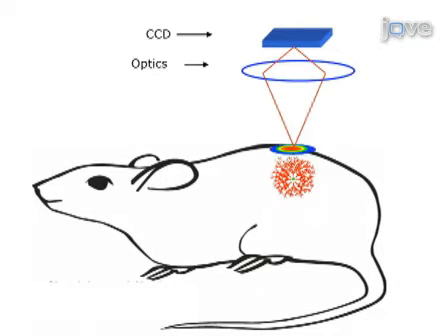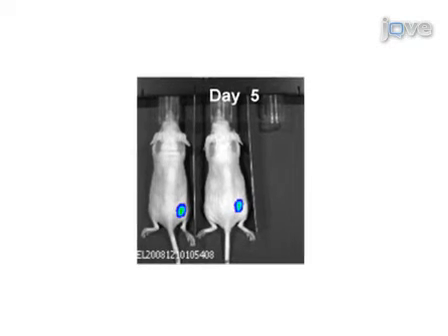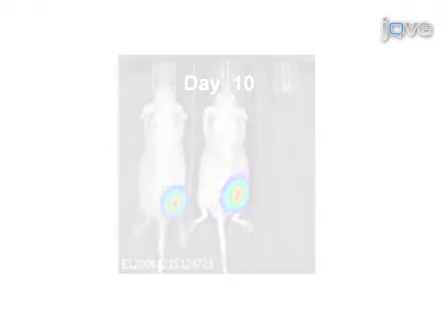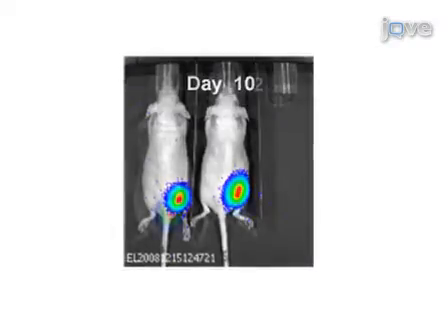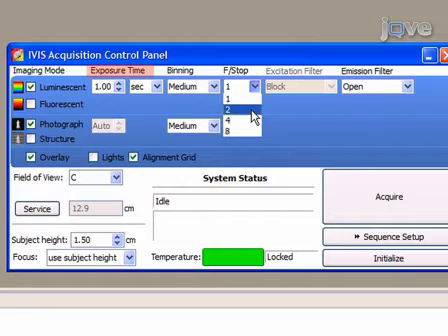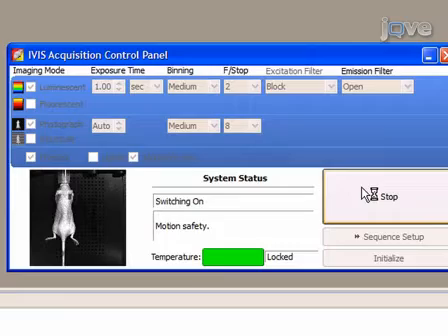Photon flux from the tumor is proportional to the number of live cells expressing luciferase, so bioluminescence correlates directly with tumor size. At five days post-implantation, the tumor is not yet palpable, but the cells can be quantified through bioluminescence and the tumor is seen to be actively growing. At this stage the bioluminescent signal is much stronger, so the exposure time, f-stop, and pixel binning can be adjusted so that the image is clear and the camera does not saturate. IVIS automatically compensates for the changes in light collection, so these measurements can be compared to those collected earlier and later in the experiment.